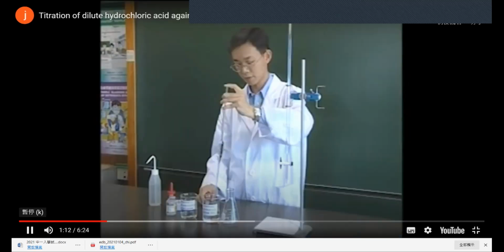They try to use the index finger for help. Okay, you never use a thumb. You use the index finger to help. Try to adjust, and then the water level will drop. Use your index finger to press the pipette, and slowly adjust until the water level just drops back to the graduation mark, and this is 25.0 cm³.